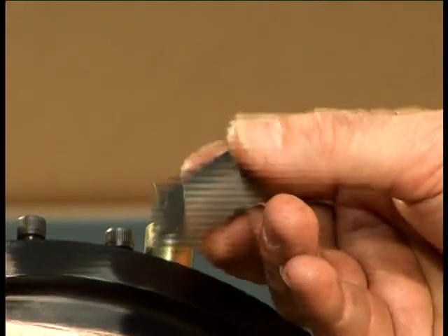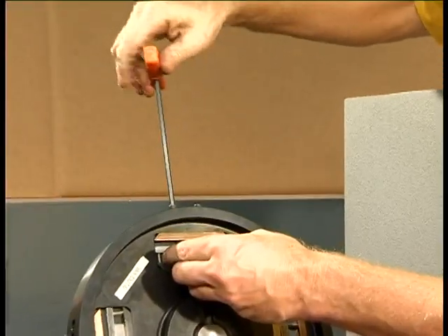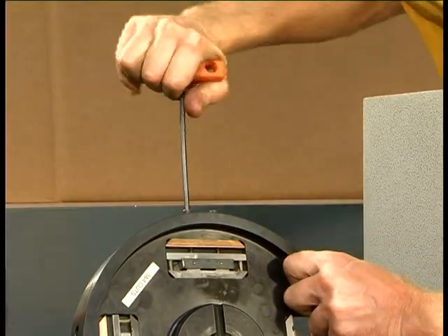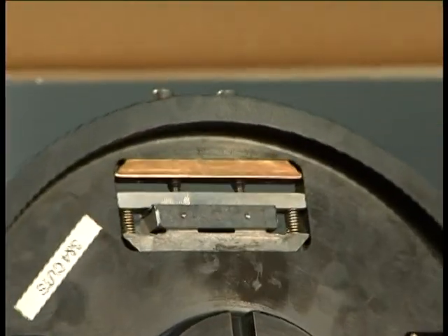Now turn the two samples through 90 degrees and secure in the third and fourth pockets. Note the previously machined surfaces are now the clamped faces. Secure the dummy specimens into the first and second pockets.